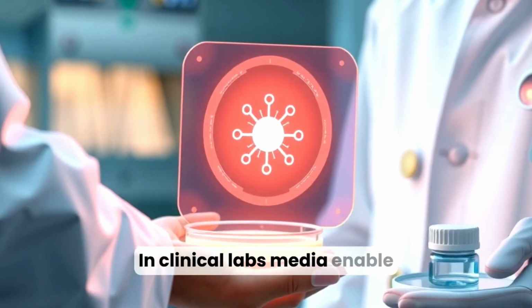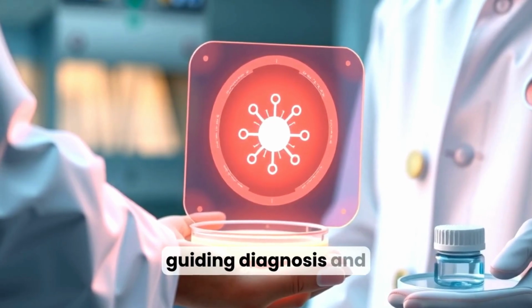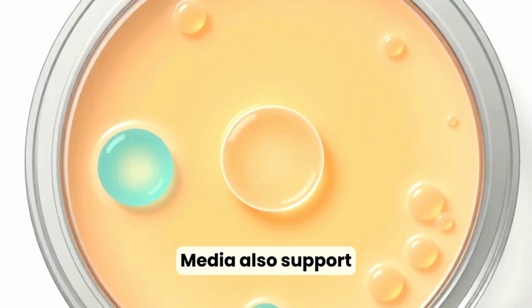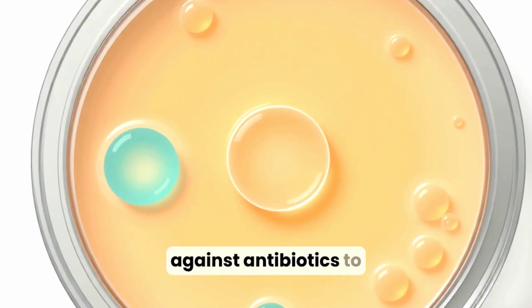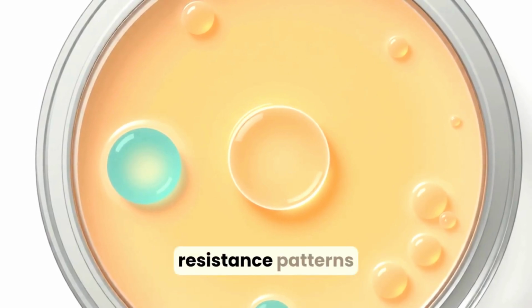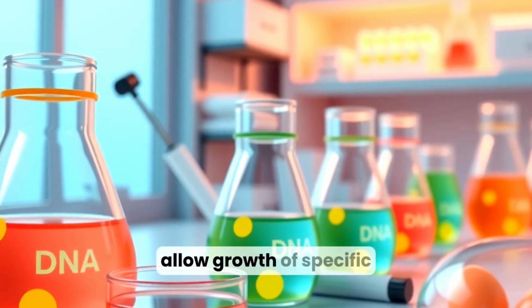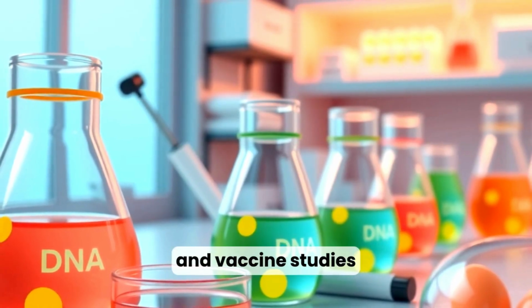In clinical labs, media enable isolation and identification, guiding diagnosis and appropriate antimicrobial therapy. Media also support antibiograms. Testing isolates against antibiotics to determine susceptibility and resistance patterns. In research, tailored media allow growth of specific strains for genetic, metabolic, and vaccine studies.